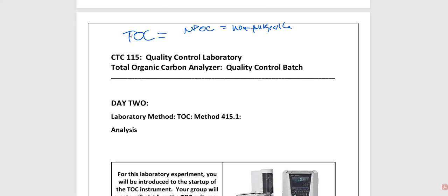So all of the volatile organic compounds are going to go away. The NPOC is what we are left over with, and the NPOC is often regarded as the total organic carbon. That is really what we often refer to it as on reports and the various other types of things that I am doing with this particular type of test. And most people know that, all right?